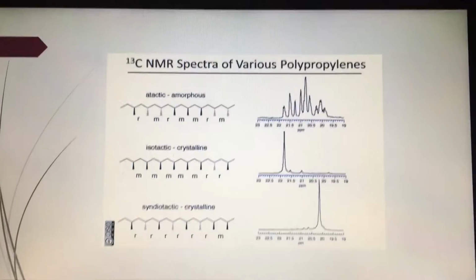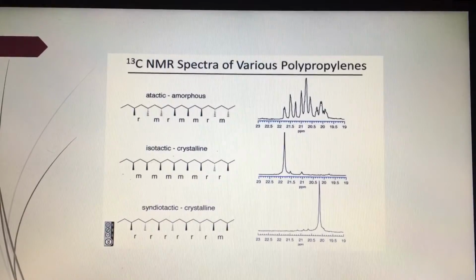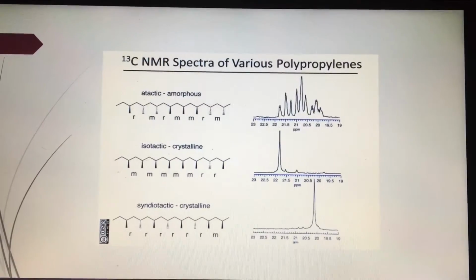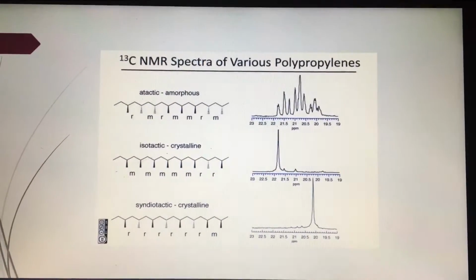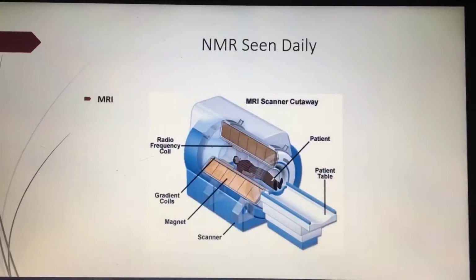When dealing with plastics in the field, it can be useful being able to characterize specific types of materials that may differ from the original sample. As seen here, there are various polypropylene samples. When running an NMR test on different samples, it can be beneficial to see the characteristics that each sample has and being able to use the right product and not creating a hazard.